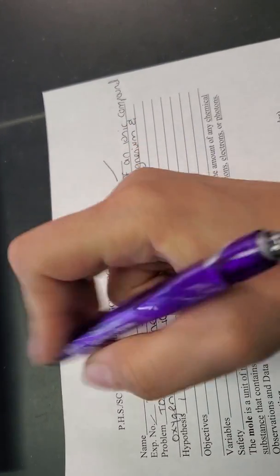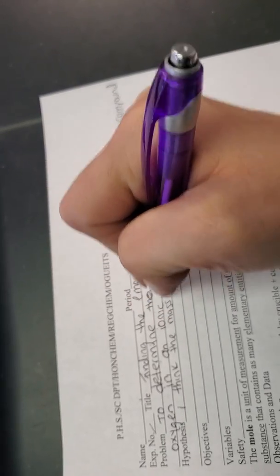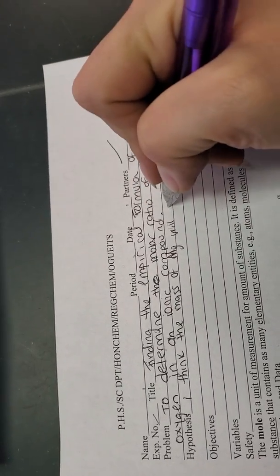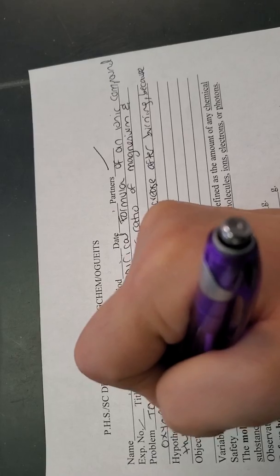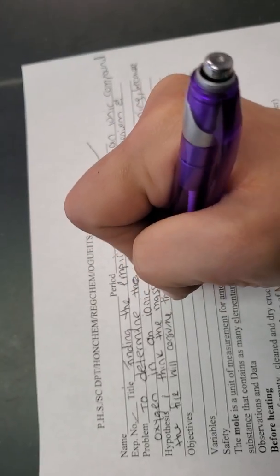Well, let's just say, I think the mass of magnesium, Mg, capital Mg, will decrease after burning. Maybe, who knows? That's my hypothesis. And now I'm going to say because the fire will consume the metal. That's my reasoning. I don't know, but I'm just hypothesizing.